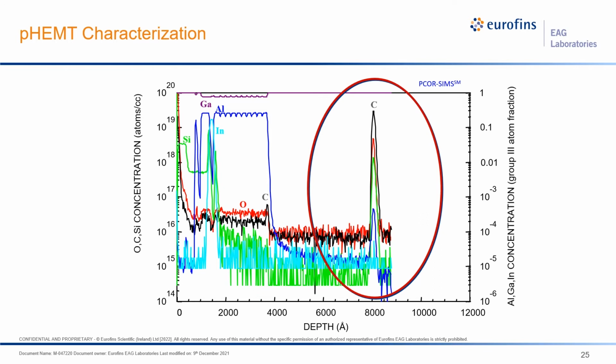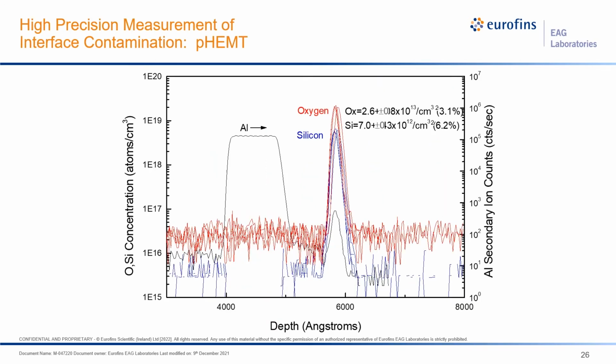So we take a wafer, say that you're interested in the distribution of these impurities at the epi-substrate interface across a wafer, you would make a measurement, say at the center, a number of times in a sequence of measuring it at different edge points, and compare the edge point measurements to the center measurement that's repeated. The center measurement or close proximity measurements assumes that the concentration of these impurities are the same.